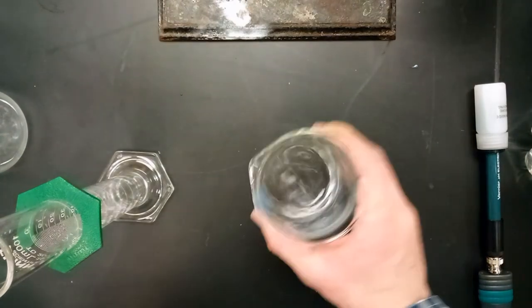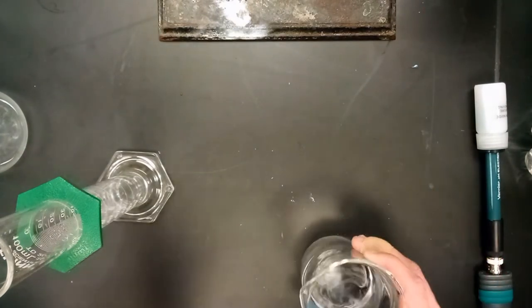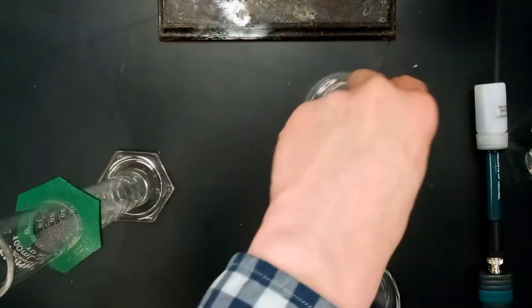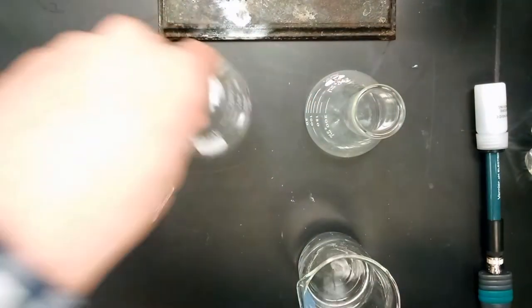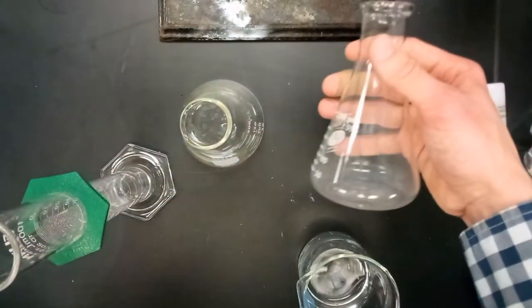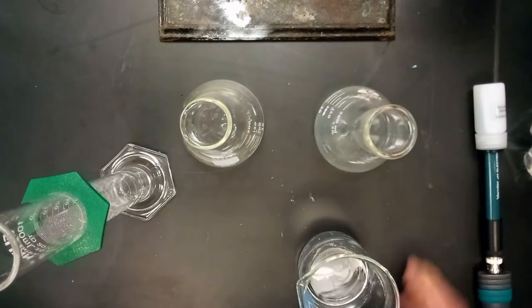Once your KHP is thoroughly dissolved like so, we're going to need to put an equal amount into these two Erlenmeyer flasks based on their shape. You can tell what type of flask they are.